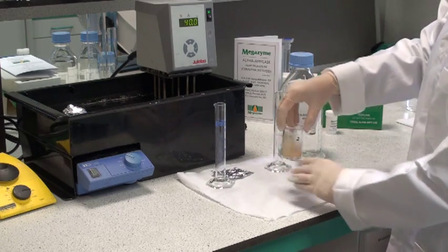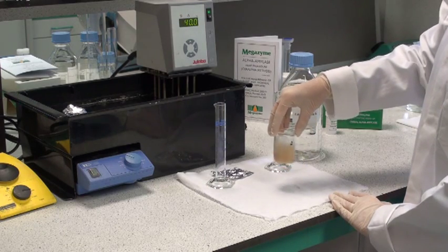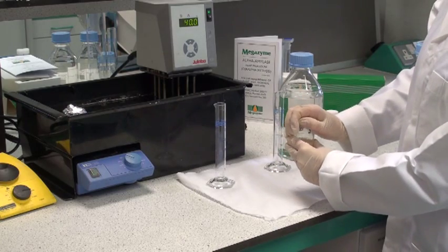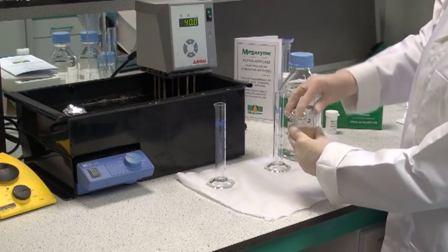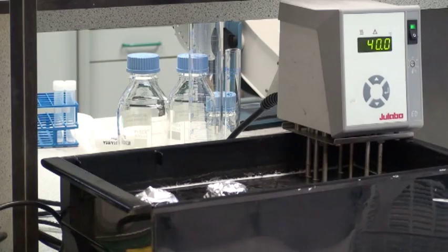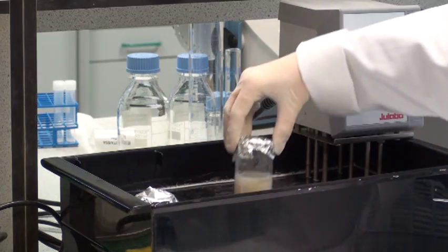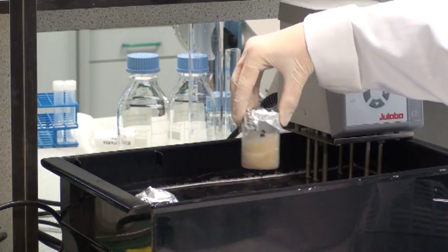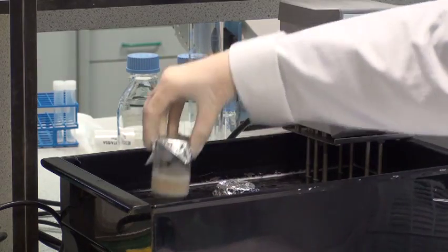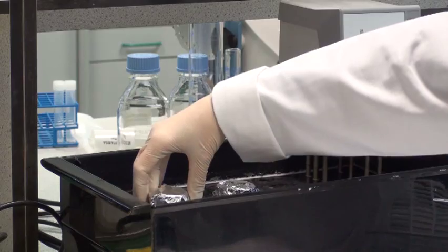During this incubation period of 15 to 20 minutes, soluble starch in the sample is hydrolysed by the endogenous amylase present, otherwise this would act as a competitive substrate in the assay. During the 15 to 20 minute incubation period, occasionally remove the beakers from the water bath and swirl. This will help enzyme extraction.